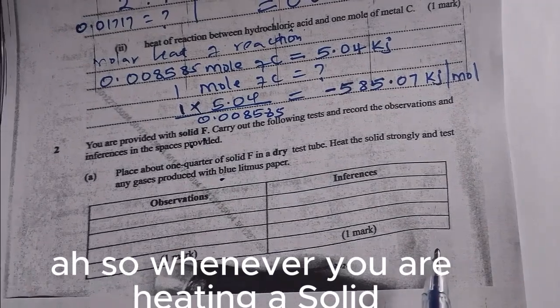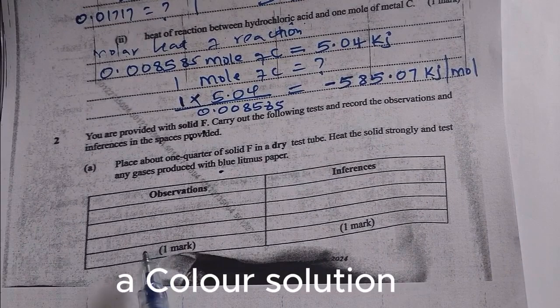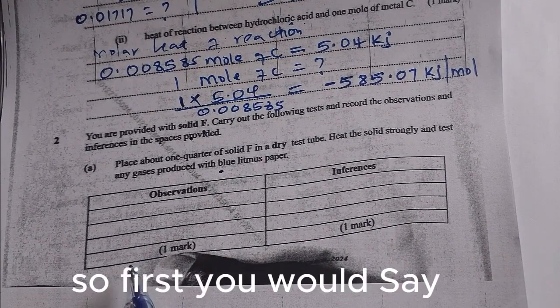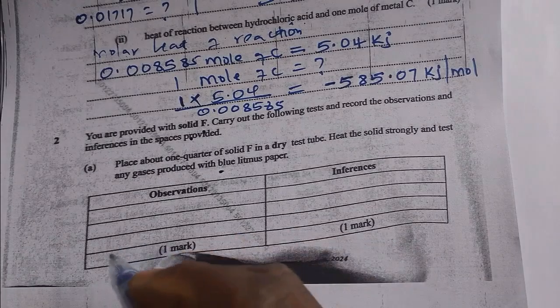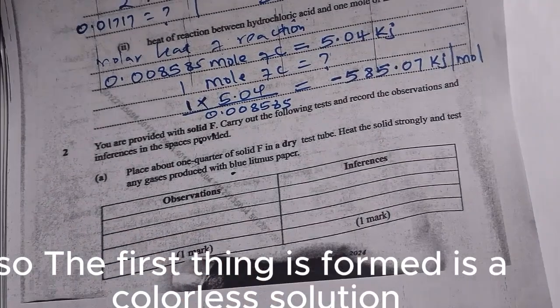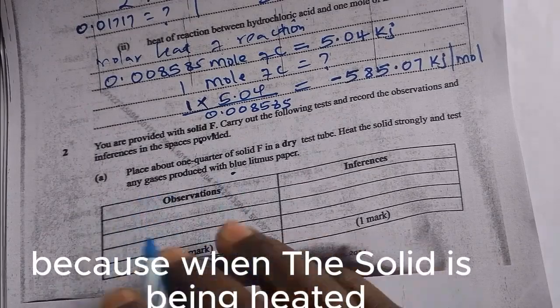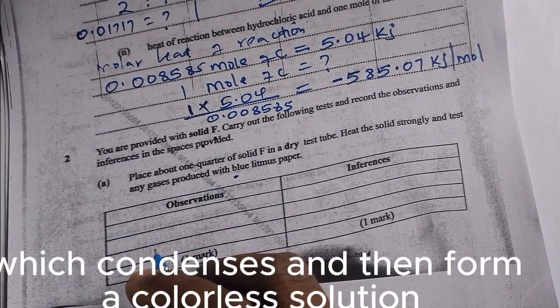Whenever you are heating a solid, one thing that is produced is a colorless liquid. When the solid is being heated, moisture is produced which condenses and forms a colorless liquid.